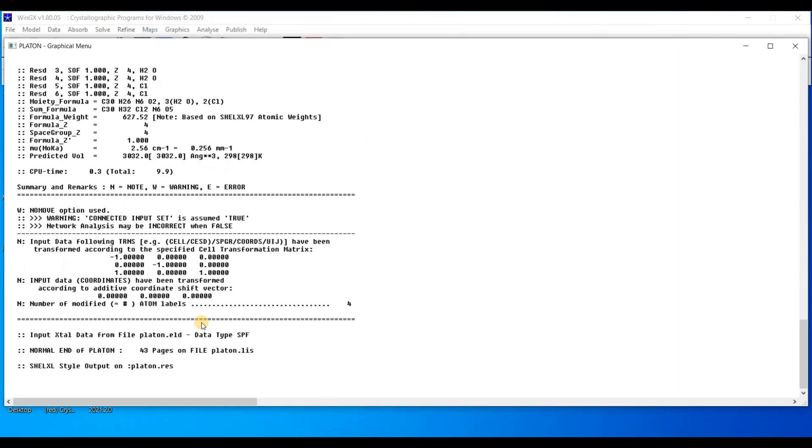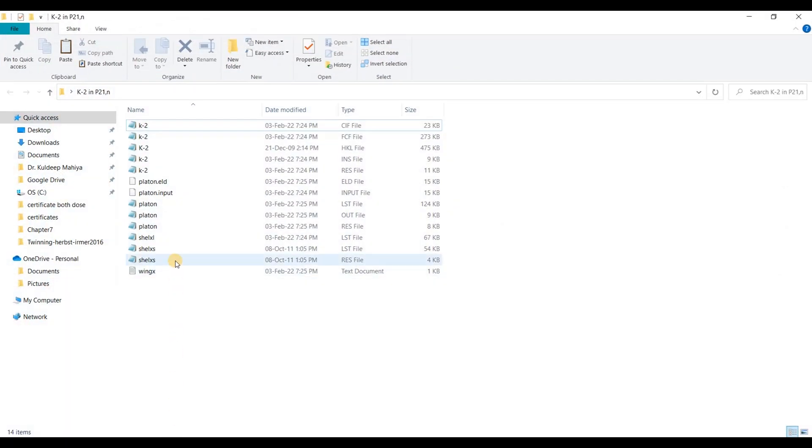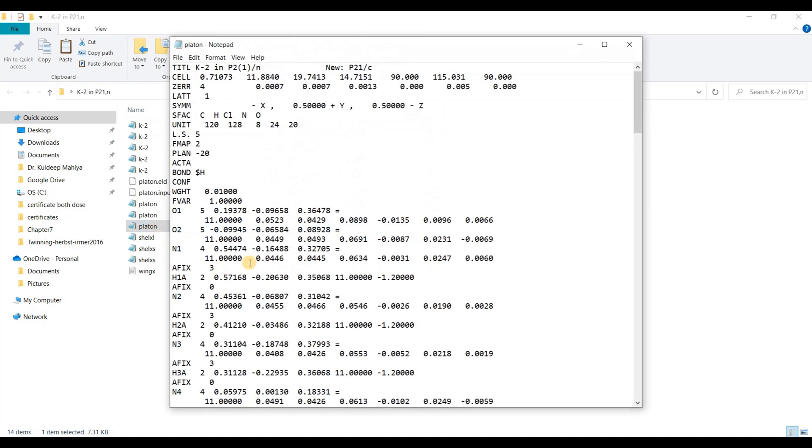And there is a new file with name platon.res in the same folder. Close it. Here you can see a new file platon.res. If you are going to open this, then you can find new P21/c. And the earlier was P21/n.